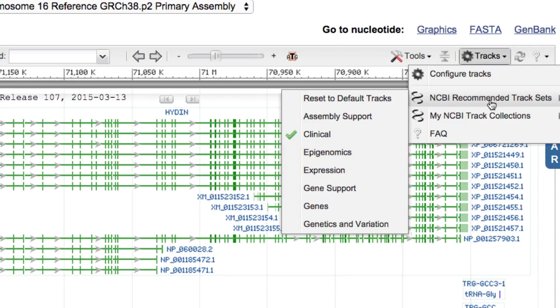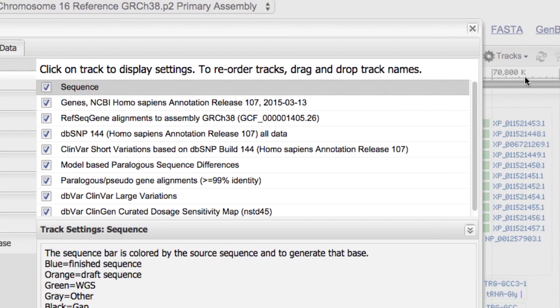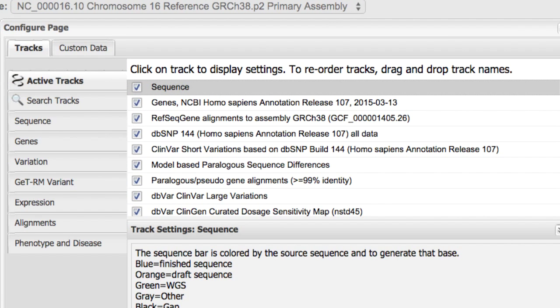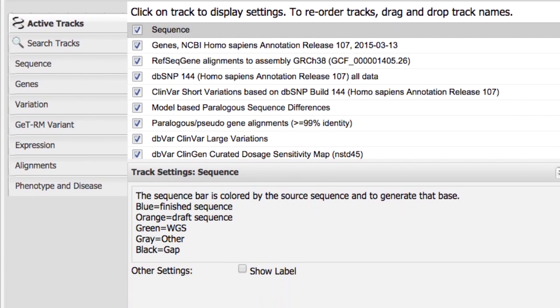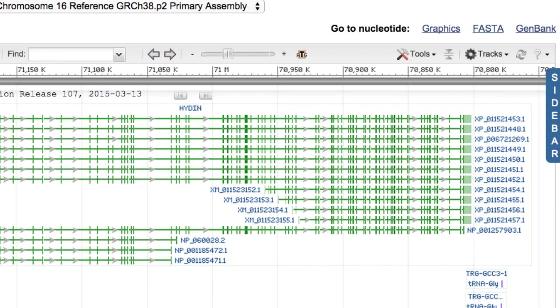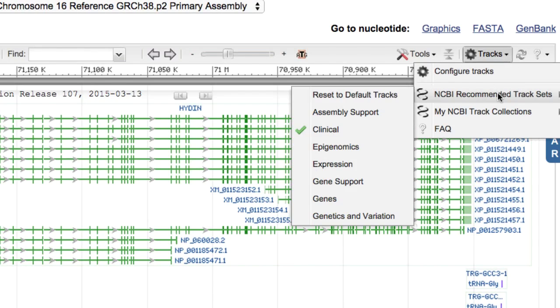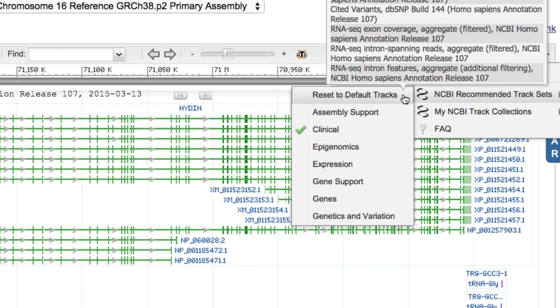Other sets include tracks that emphasize expression differences or support for gene annotation or the underlying genomic assembly. To further modify the tracks in the display, you can use the Configure Tracks menu. This allows à la carte selection of tracks or changes to track display settings. To return to the default display for the current page, click the link Reset to Default Tracks.